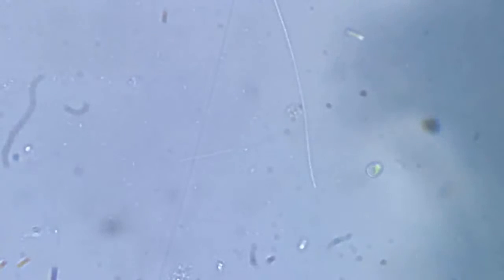Okay, we can see some movements in the body, some streaming happening in the body, but still we are not able to find a proper head. This is more than 700 times magnified. When we see this worm moving straight, it's just tremendously long given its width. Just imagine the size of this animal, just like flowing.